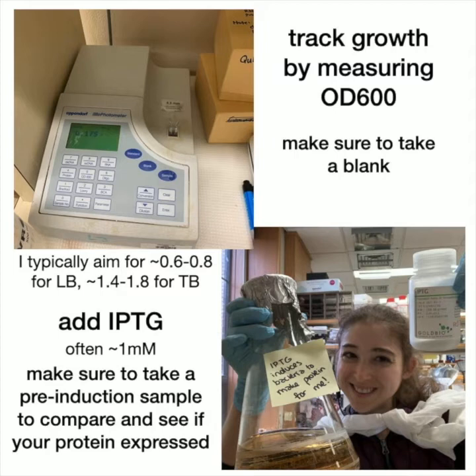So you're making a lot, but it's really low quality, because you're going too fast, or you're overflowing your cells with this protein that isn't very helpful to them. So one of the things you can do if you're having expression problems is use a lower IPTG concentration, or don't let the expression go for as long, or lower the expression temperature.